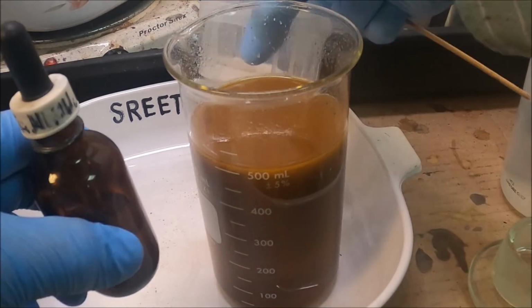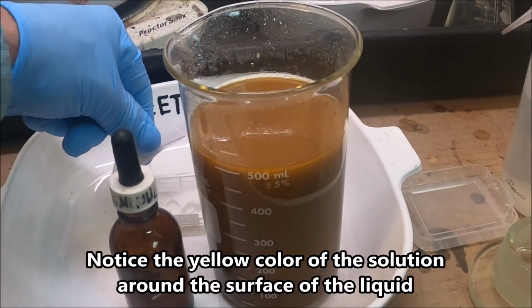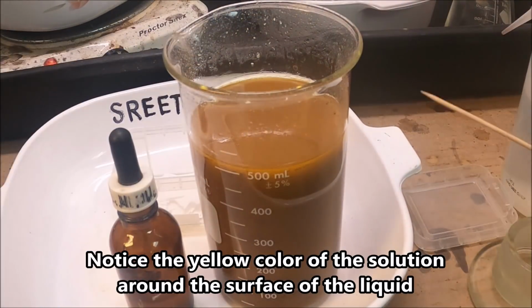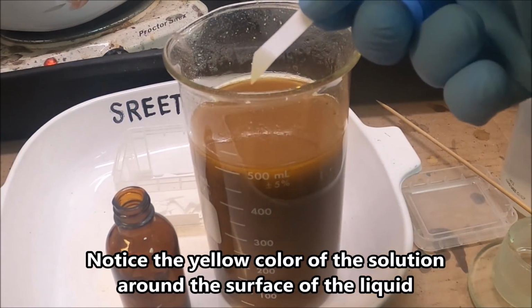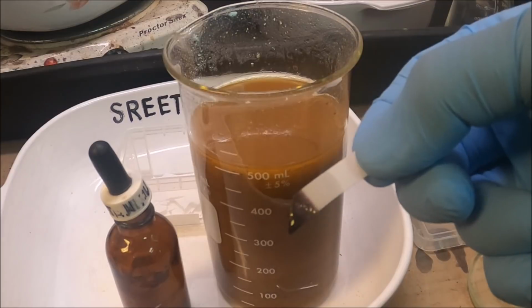All right, let's do a stannous chloride test here. I've got some pieces of filter paper cut up, and I stick it on the end. Well, I don't need to. I just dip it right in with my hand here. And we're going to see if we got all the gold out of solution yet. And no, we do not. Still have gold in solution.